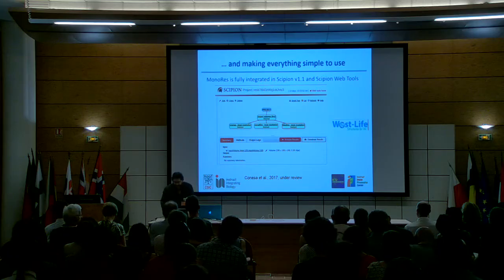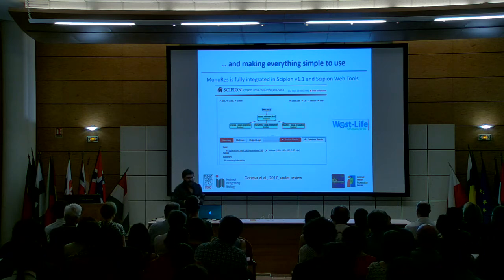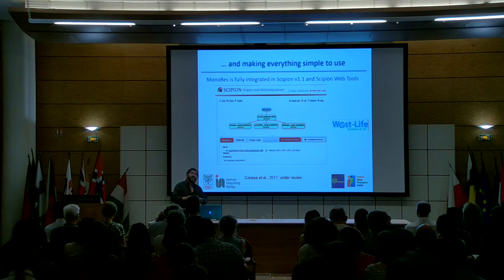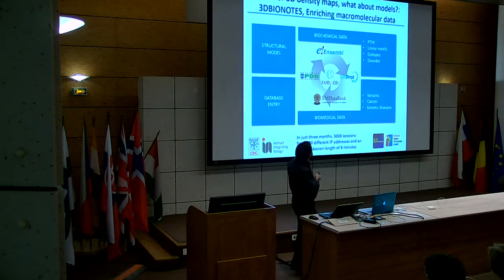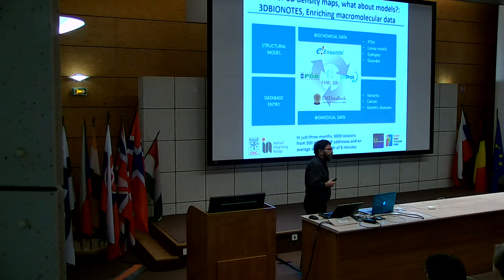And at this moment, with all these methods, we are probably doing almost our best, and it may be difficult to get much better in the definition of quality and resolution of the maps, which are actually the volumes. There is a whole other thing: from the maps, you have to go to the atomic resolution structure through modeling.